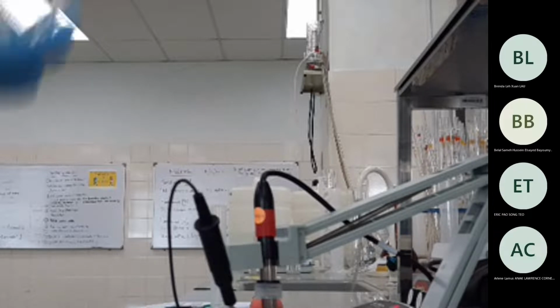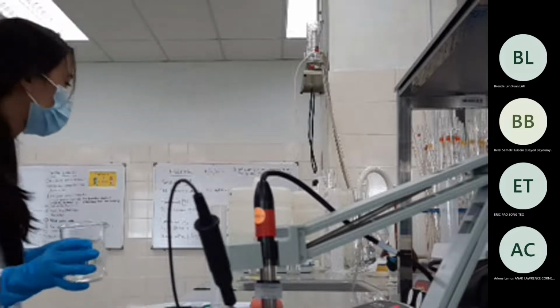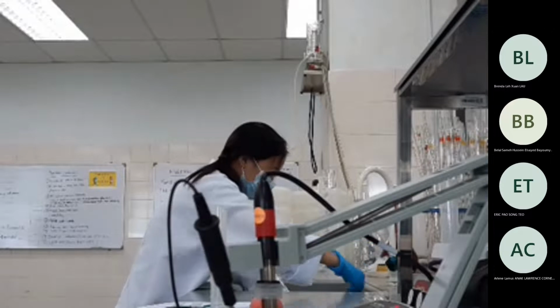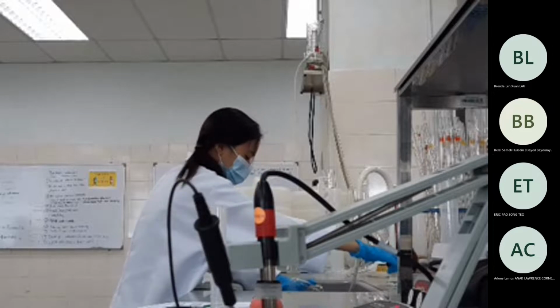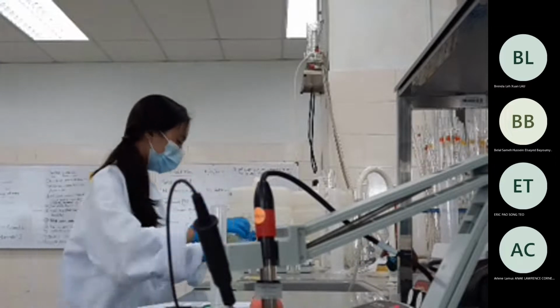So take the 250 milliliter beaker, wash it with tap water first, and then rinse it with the distilled water, right? And then add.